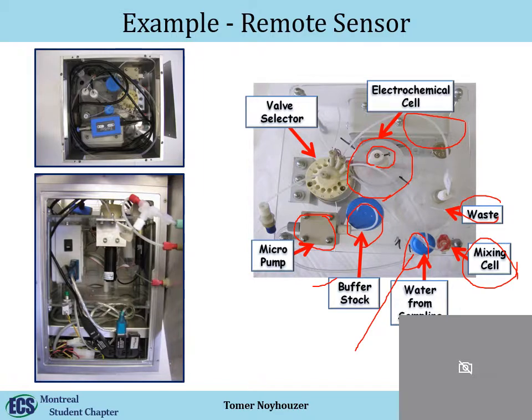And here you can see we had a limitation about the size of the sensor. So we had a weight limitation. I think it was less than 10 kilos. And it was supposed to be 40 centimeters, if I'm not mistaken, 40 by 40, and the height was about 82. And we used a very small potentiostat. This is the PalmSens EmStat potentiostat, which is very good and programmable. And you can see everything is really messy, but it was all inside.